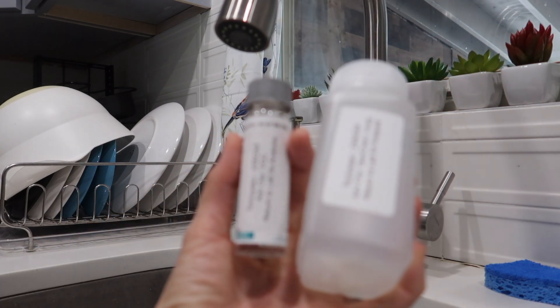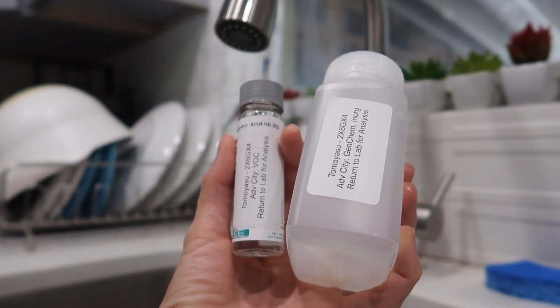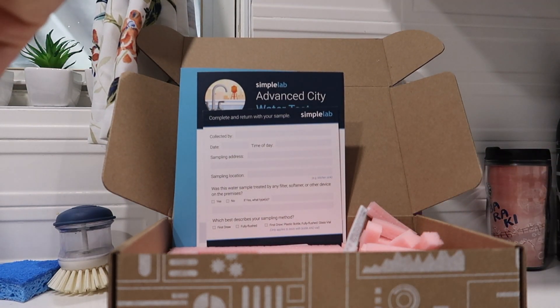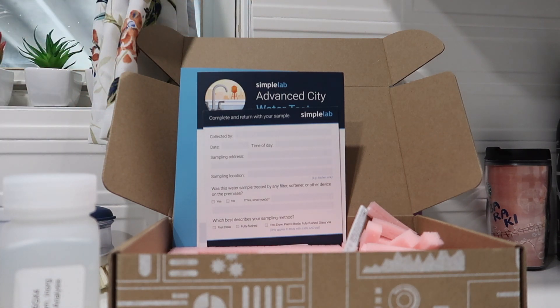Now I've got both of these done and I am going to pack them back in the box and mail them in today, and I guess we will hear back from them in a week or so. Stay tuned!